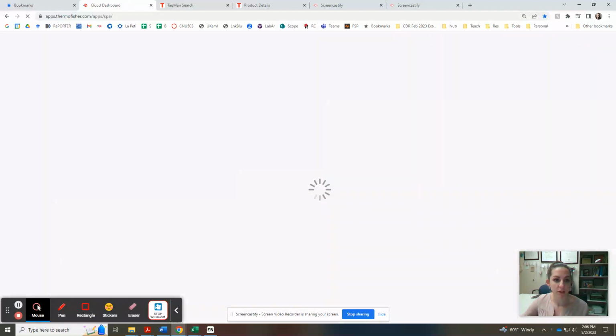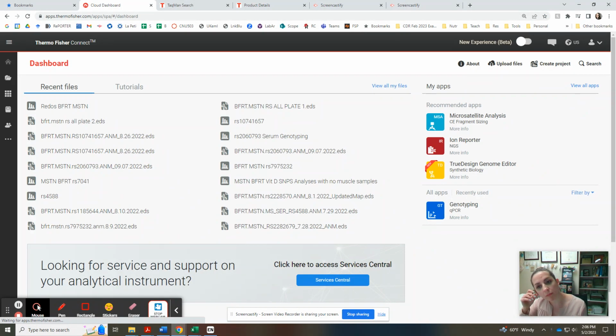Hi there, this video is to show you how to use Thermo Fisher's cloud-based software to do genotyping calls on a plate with multiple SNPs. So we're going to head into the software.